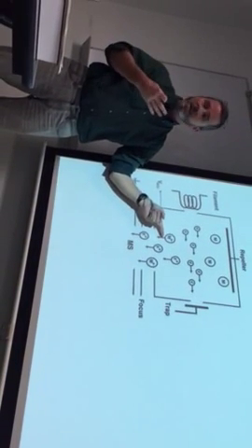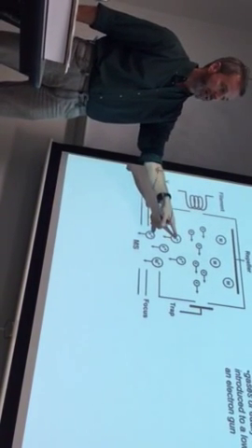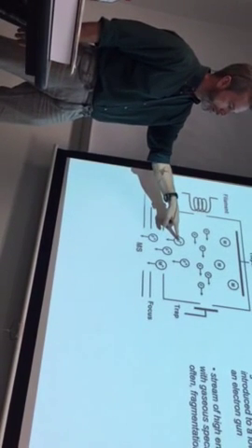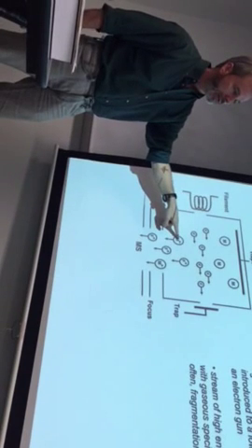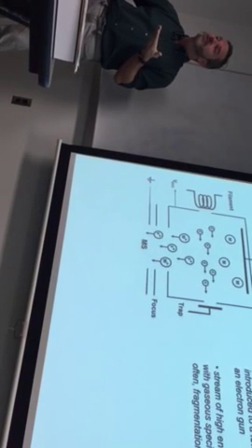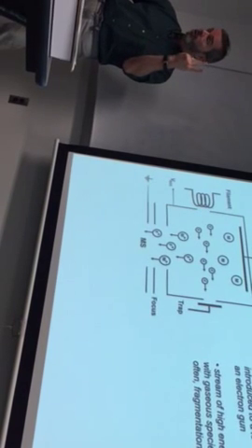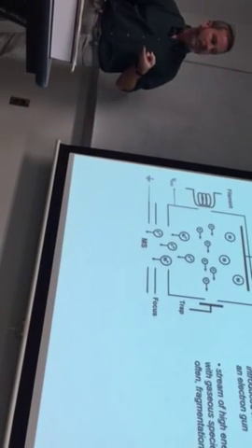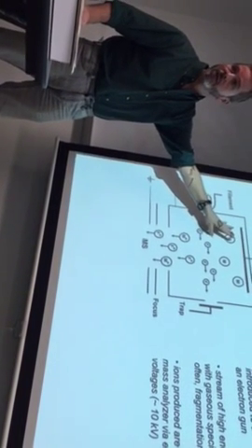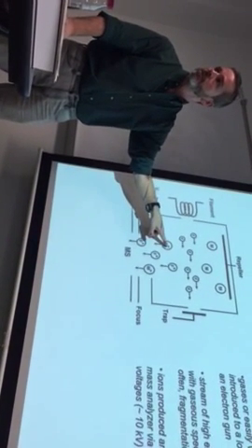The most common ionization process is one whereby the analyte species lose a single electron. They become monovalent cations, right? 1+ charge. There is a much lesser probability that there are other ionization reactions going on, for example forming a dication using 2 electrons. But the predominant process for sure for electron ionization of gas phase molecules is the loss of a single electron. So these gas phase cations are produced.